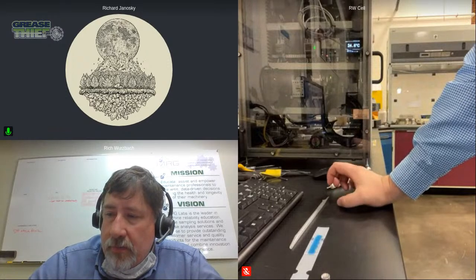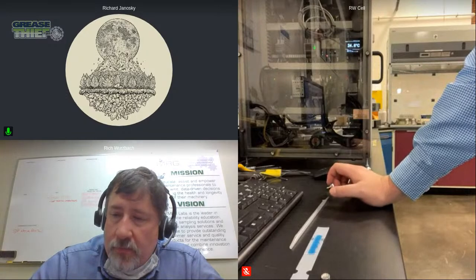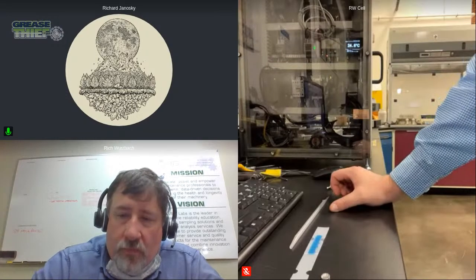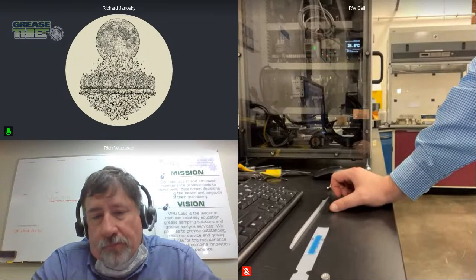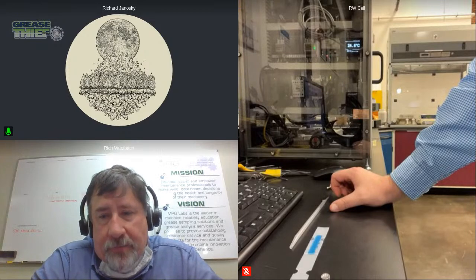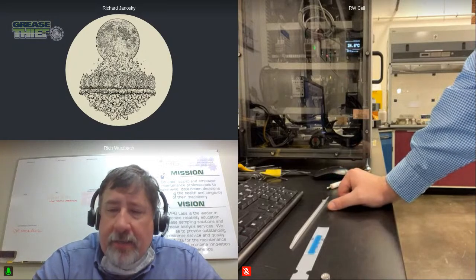And the PAS, the photoacoustic technology, allows us to remove those previous issues with the particles, and you're hitting it with the photoacoustic signal. There's a microphone inside that's recording the response across the spectrum, so it still is recording the response to the wavelength. So it still is the same graph. Sorry, go ahead.